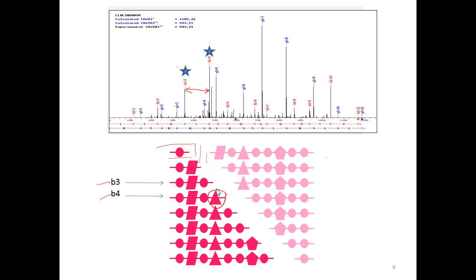So in principle, this is not the way things are normally done, because it's too complex a problem, but you could just take a slide rule or whatever and measure the distances between these various peaks, deduce the amino acids that are present, and then look at a database and see which proteins have those amino acids in that order. But that's too complicated a problem, and for instance, how would you know that this red peak goes to this red peak? You wouldn't know necessarily that you shouldn't be measuring that peak, or this peak.